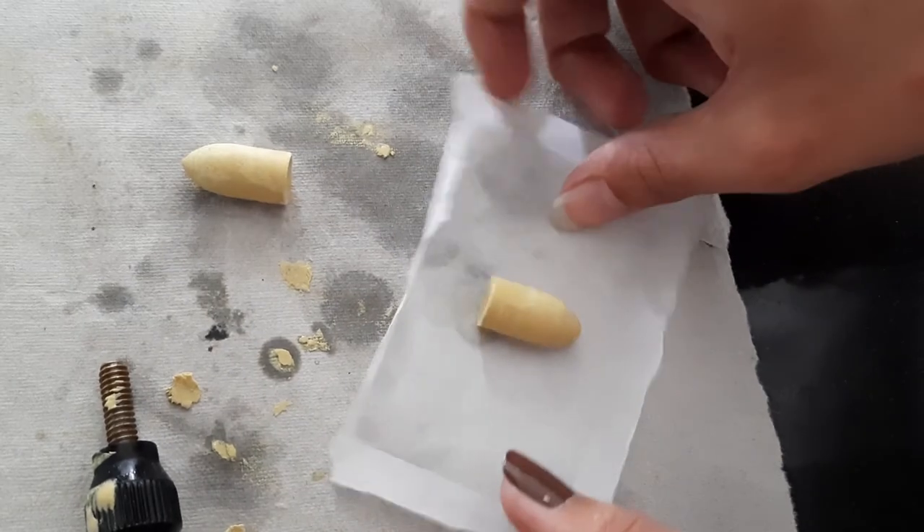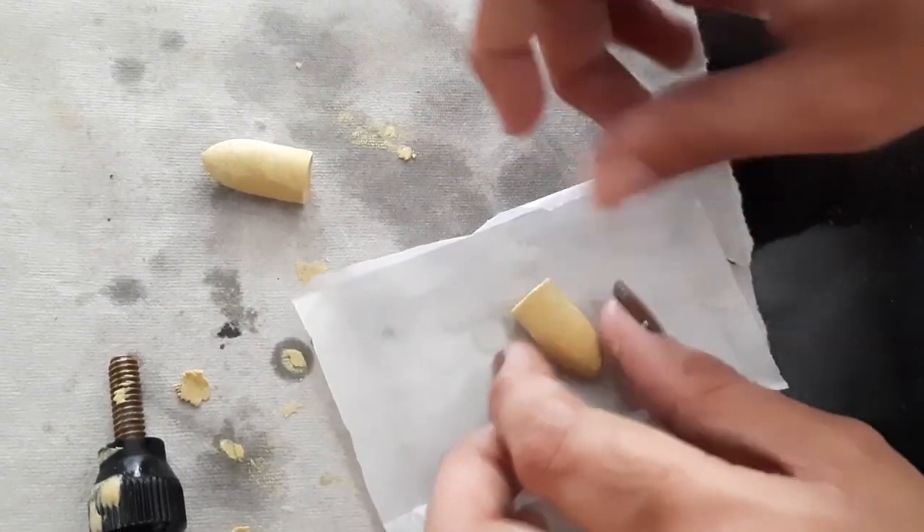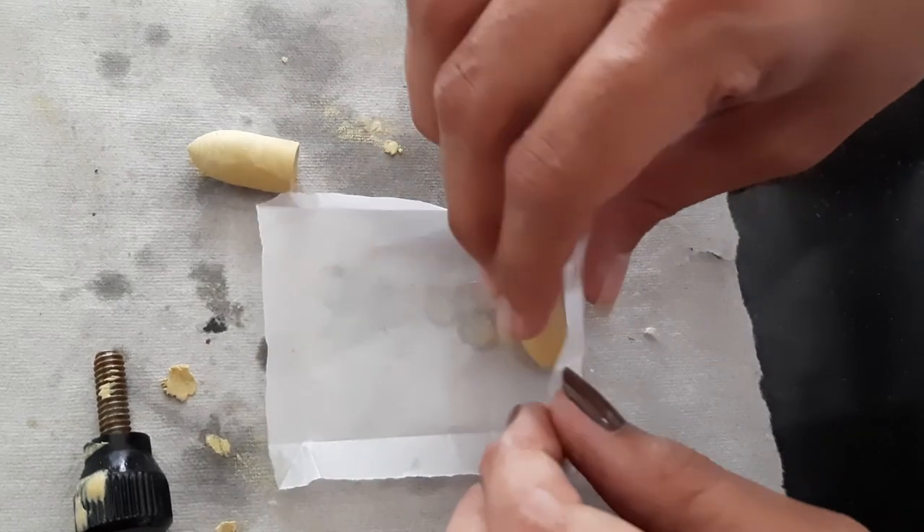The two suppositories are obtained. Wrap each suppository in butter paper as per requirement.